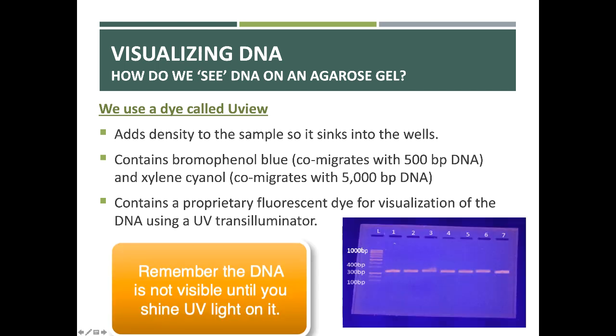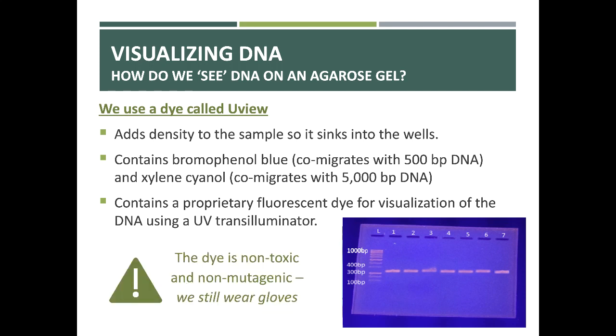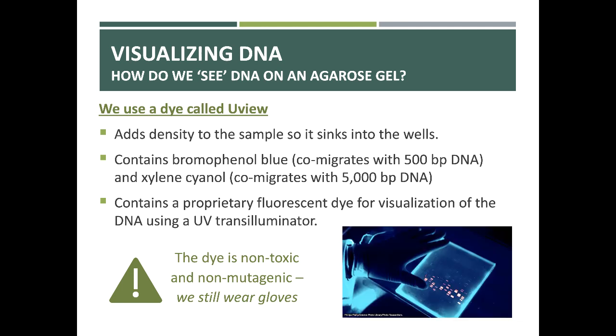And so when you put it under a UV transilluminator, this is what you see, something like this. We used to use a dye that was mutagenic, and so we always wore gloves. This one's not mutagenic, but even still, we always wear gloves when we work with any chemical that binds DNA, just as a precaution.